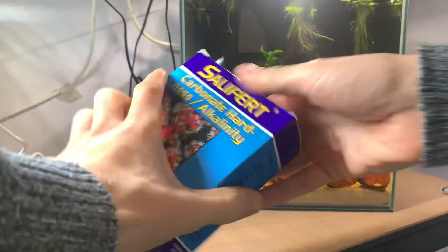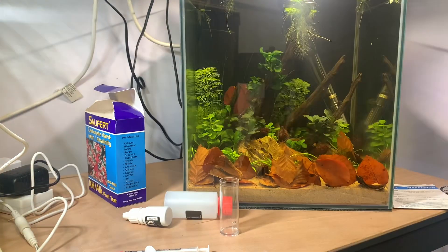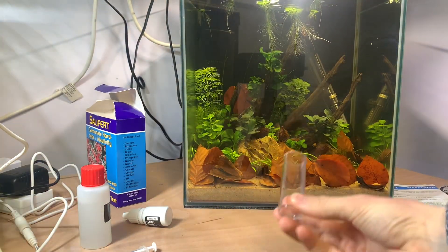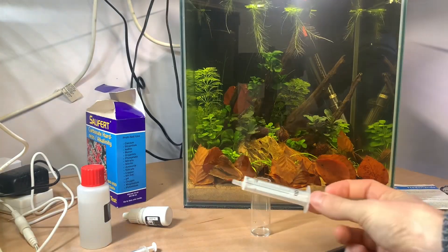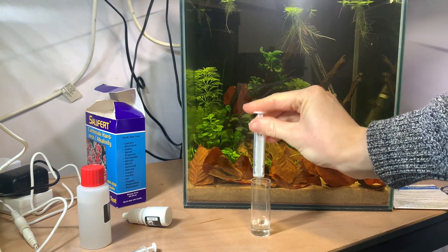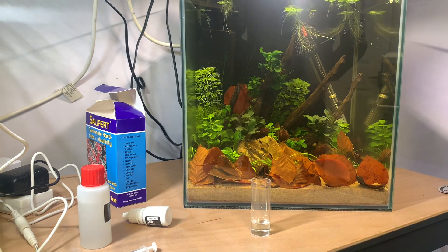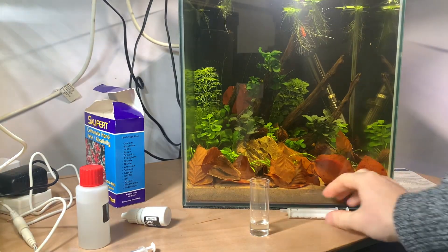So here is my test kit — I'm going to pour out the contents so you can see what's inside. It comes with a nice instruction leaflet which I always keep on hand just in case. We've got a test tube or vial for holding our sample, and a 5ml pipette. I'm going to draw 4ml into my syringe and pop that into my vial. You can also use 2ml for a low sensitivity test, but I'm using the full 4ml to get a very accurate result.